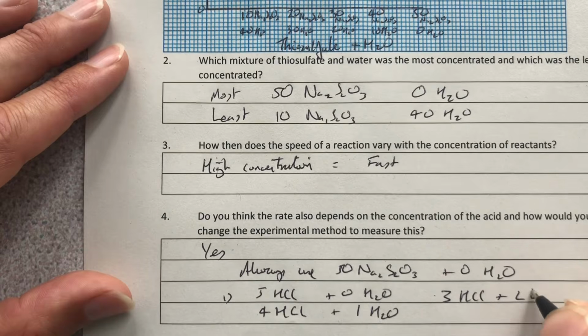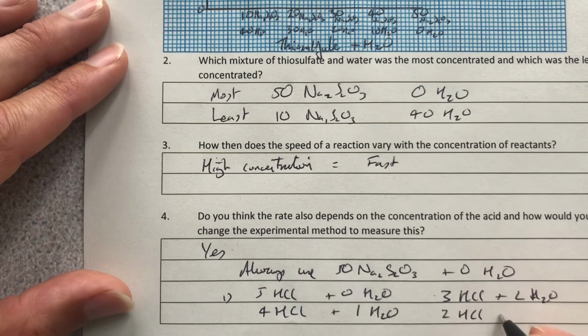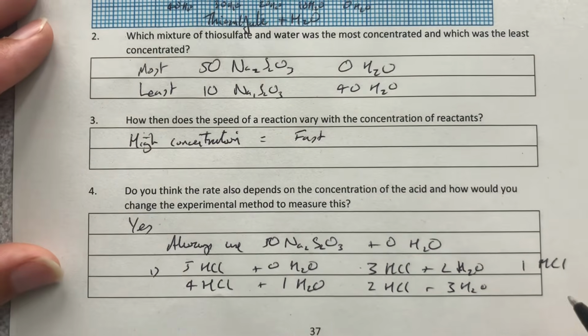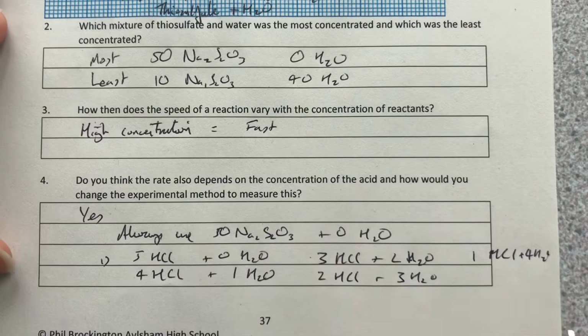So we're doing exactly the same. We're just changing the volume of hydrochloric acid and water. Always adds up to 5 again. Okay, and then we can do the fifth one with 1 HCl and 4 water. 5 experiments, just changing the acid that time.